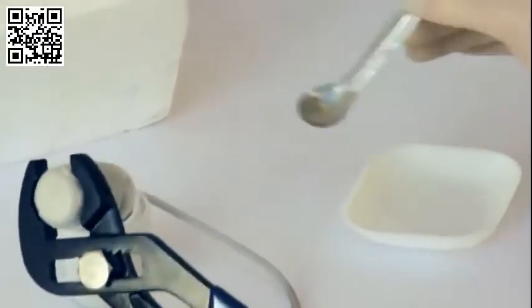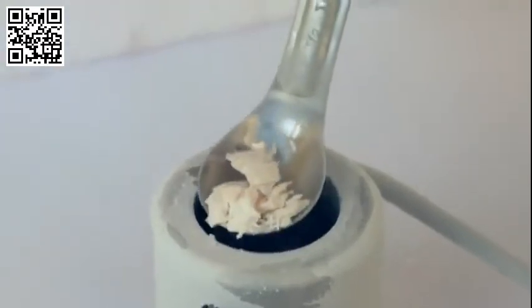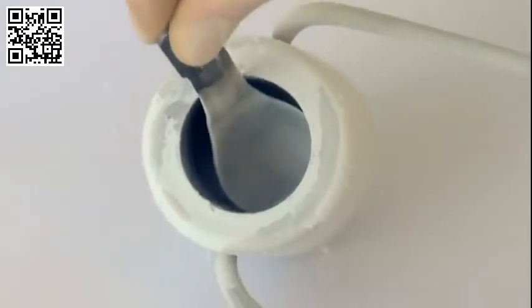The chilled recovery spoon is used to remove the sample. The vast majority is recovered at the first attempt, but even minute samples can be effectively recovered afterwards.